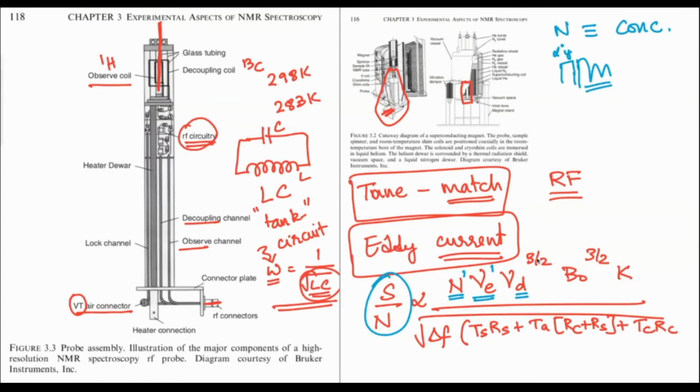This is a very important aspect, which is also why solution state NMR spectroscopy starts from proton and detects in proton, because if the excitation and the detection nucleus is proton, you gain the maximum in terms of the gyromagnetic ratio. Of course, in the previous lecture, you might have seen an experiment where you started from proton and finished with carbon. In that case, you're going to have gamma h power 1 and gamma c power 3 by 2. Once again, we will see as we go forward to 2D NMR, which is why we will not prefer the carbon direct detect. We'll be going to proton and detecting.